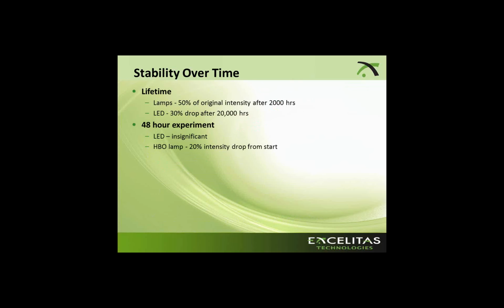I also wanted to point out stability over time. If you look at the lifetime of our lamps, which we guarantee for 2,000 hours, the intensity of the lamp from start to 2,000 hours goes down by 50%. This is just an inherent property of the lamps.